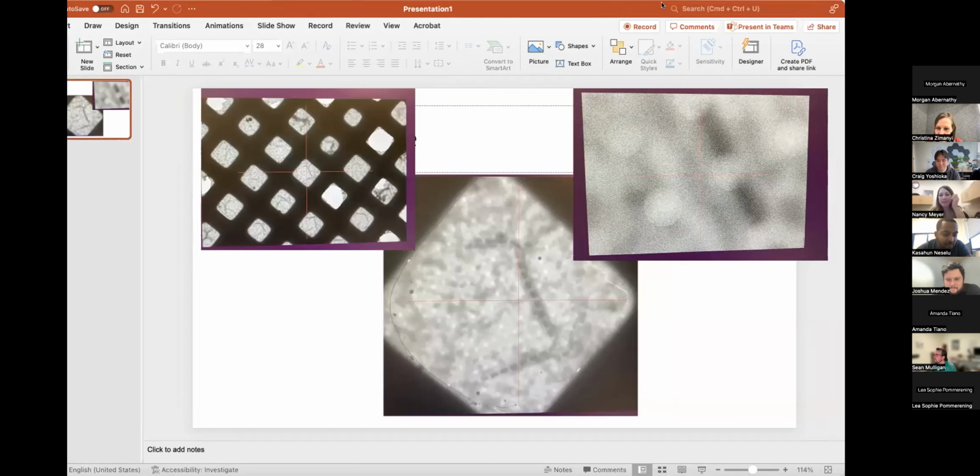Yeah, I have seen this before too. Are the dashes grid specific? Say more. They seem to go between the holes, so the dashes are created by where the holes are. It's either a ridge or a trough, is my guess. For some reason it's following that pattern, and then the holes just create the dash effect. Also, carbon copper grids shrink a little bit under liquid nitrogen temperatures, so you can get variations in height, troughs and ridges, like Nancy was saying.